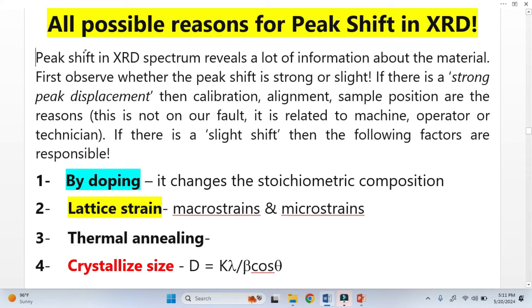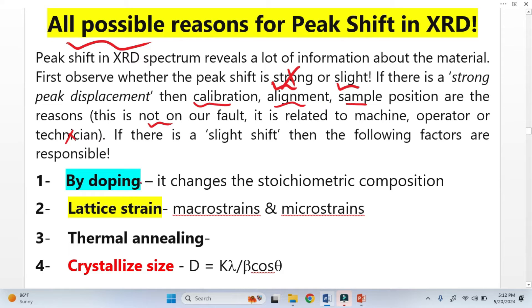There are two types of peak shifts: one is a strong peak shift and another is a slight peak shift. If there is a strong peak shift, those reasons are something else — for example, calibration, alignment, or simple displacement in the machines. That is basically the operator or technician's concern. But when there is a slight displacement of the peak from original positions, these are the four factors which cause the peak shifts.